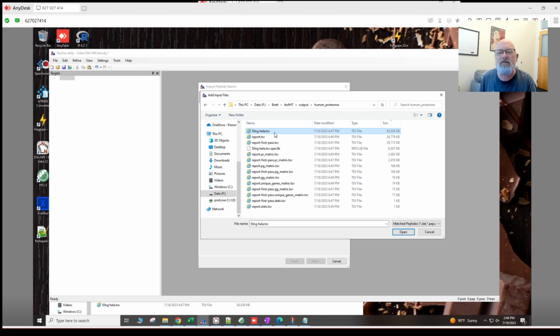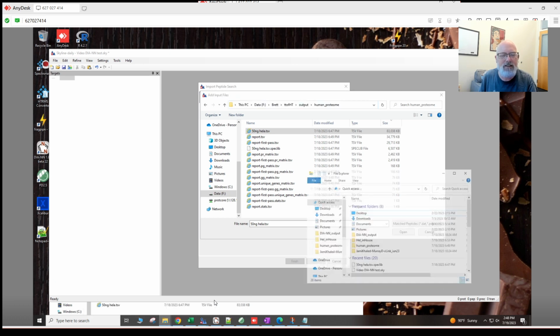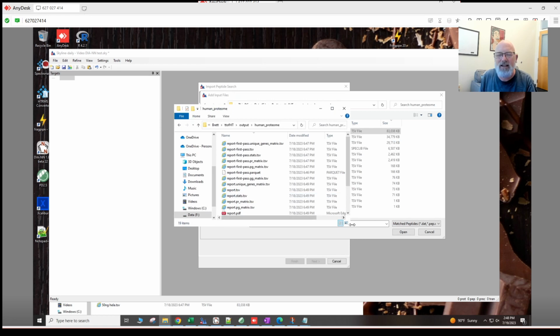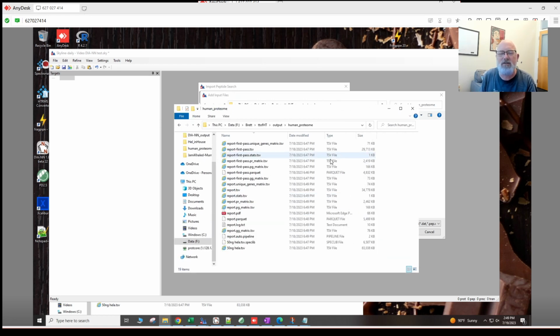So let's rename. This is the output I did. For those of you watching at home, you're probably like, you went to the wrong directory. All right, so let's open it again. And we'll redo. Let's see if what I told you is correct. So the speclib file, you'll see this one.